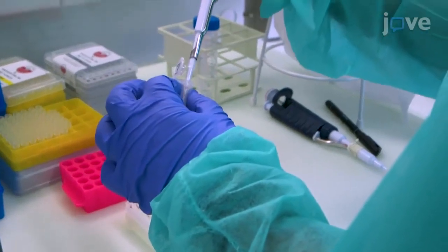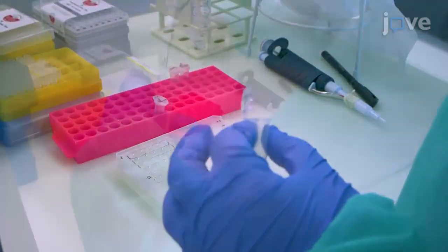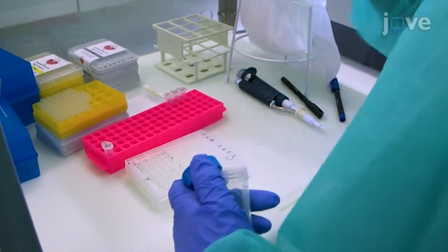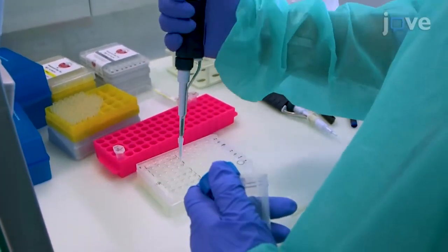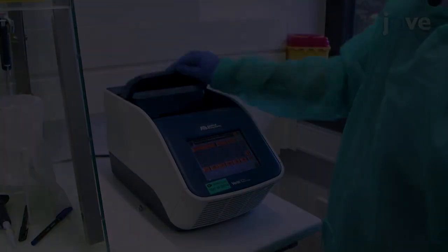Then, set up the reverse transcription or RT reaction according to manuscript directions. Prepare the endogenous RT controls by adding 5 microliters of nuclease-free water instead of the ASP reverse primer. Put the plate into the thermocycler and heat the RNA to 94 degrees Celsius.